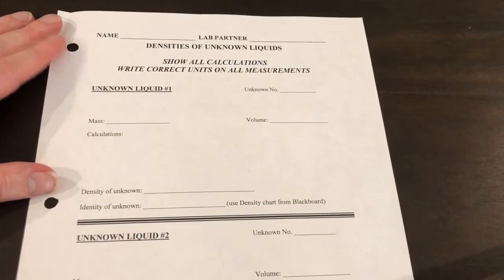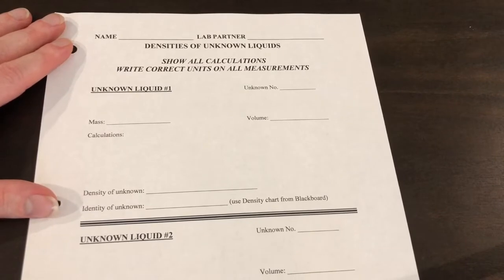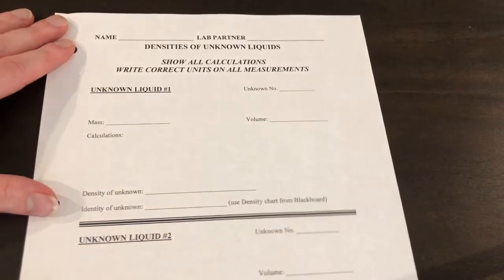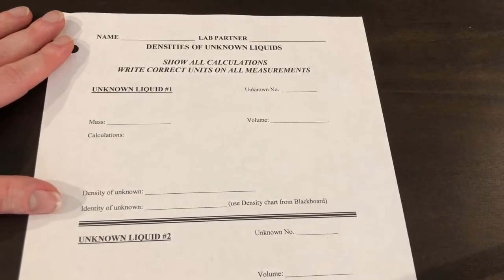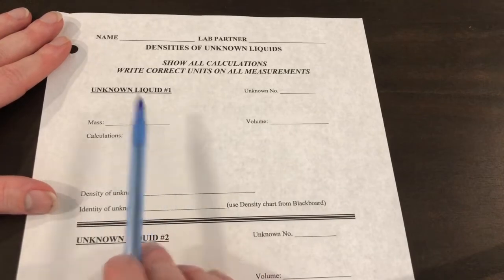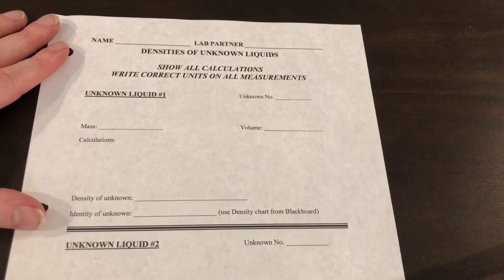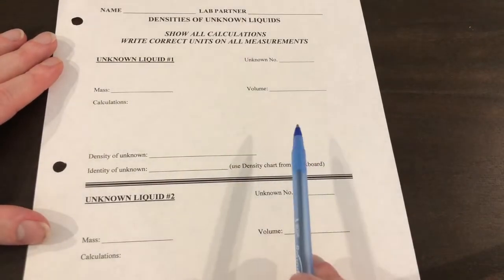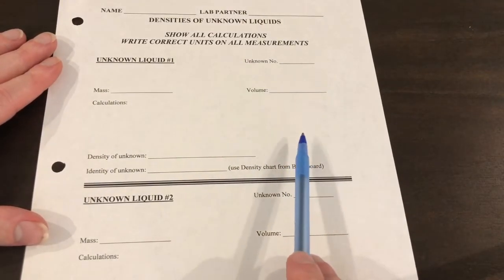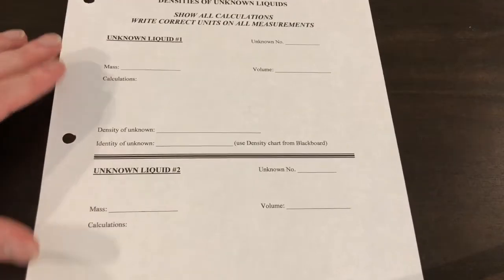This is our data table after we've completed watching the lab video over this section. The mass of the unknown liquid we get by subtracting the initial mass of the graduated cylinder from the mass of the graduated cylinder and the liquid. Our volume is read directly from the graduated cylinder in each case. For the density of the unknown, I believe the first one I did in the video smells like vinegar. So our density should be really close to that of vinegar, or acetic acid.